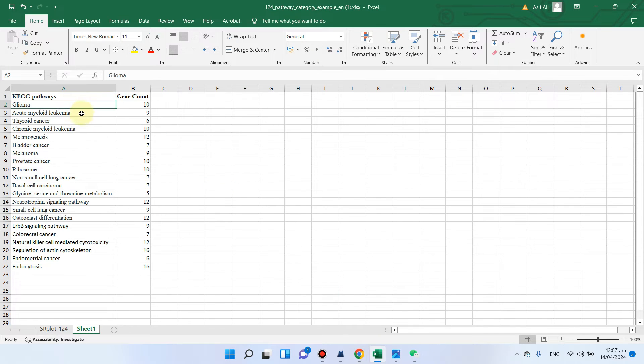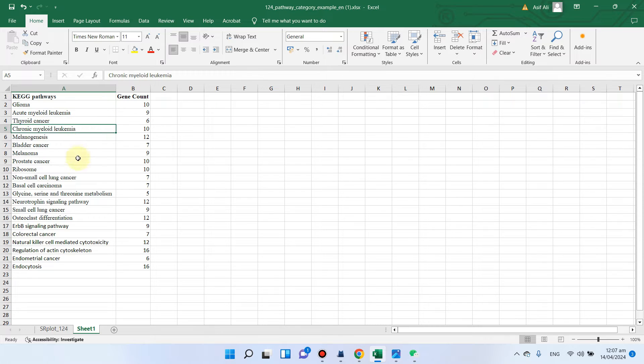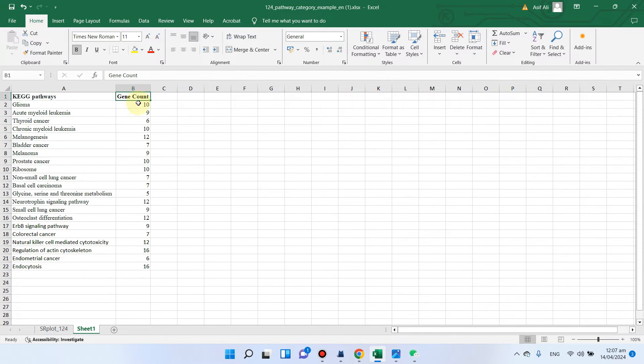Here you can see we have different KEGG pathway names in the first column, and in the second column we have only gene counts.